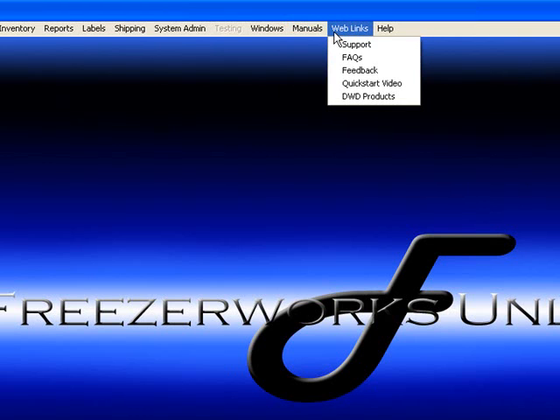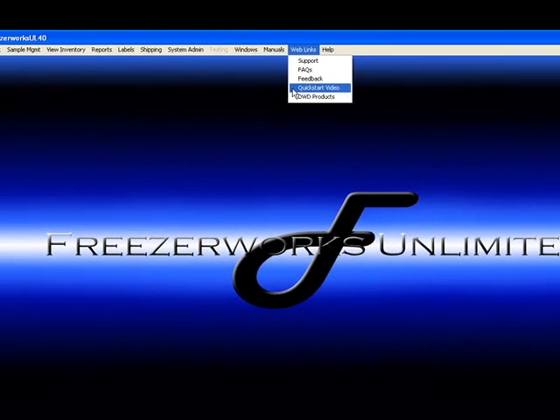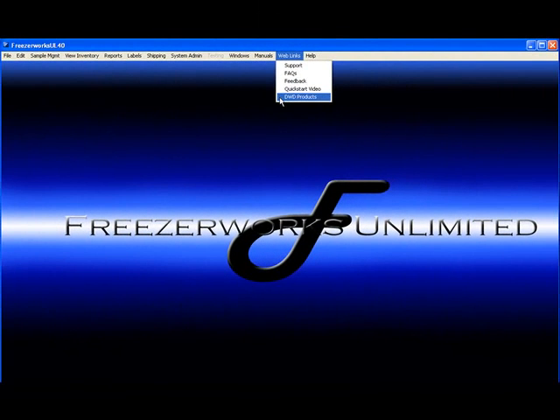Web links will give you a link directly to our website to get information you need on FAQs, to request support, to give feedback, to view videos like this one on options, and to get information on our products for ordering information and such. And that's a quick look at Freezerworks Unlimited 4.0 and our new features.